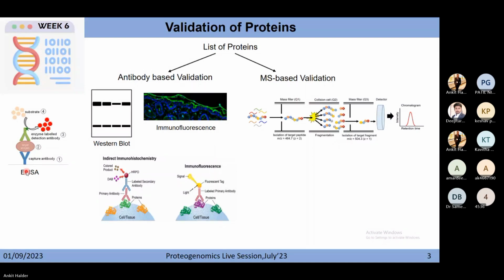So this can be an experimental strategy where you have done an MS-based analysis. For example, you have taken patients having malaria who have got severe and who have got non-severe. You have run your MS-based analysis, you have identified the protein markers, and then you validated it in ELISA, and you have shown the actual quantifiable level of the protein.